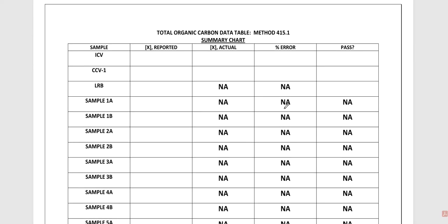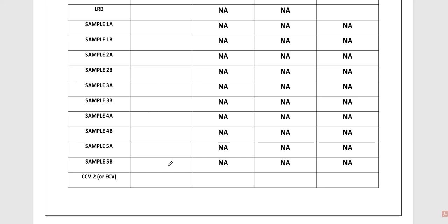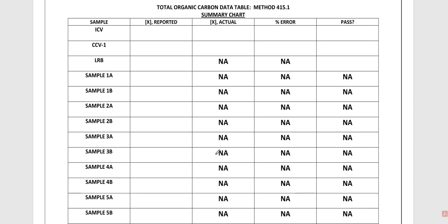Data sheet's going to end up with something like a summary table. The first column is going to be the concentration that has been reported. So whatever shows up on the data sheet, I'm going to write that down into an actual document. It seems redundant, but it's not. Writing it with pen and paper is great. Printing it off, absolutely, that's backup. Saving in electronic form, wonderful. We'll add that to the mix. We do all of the above.